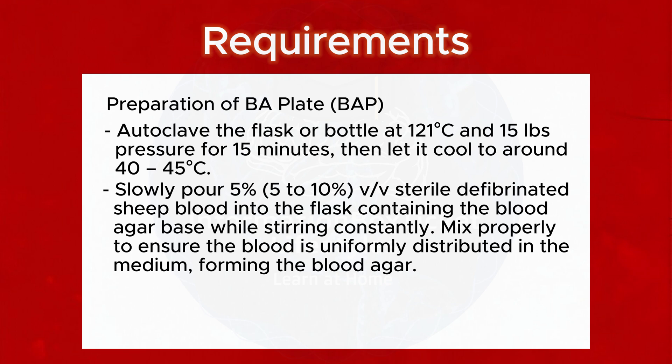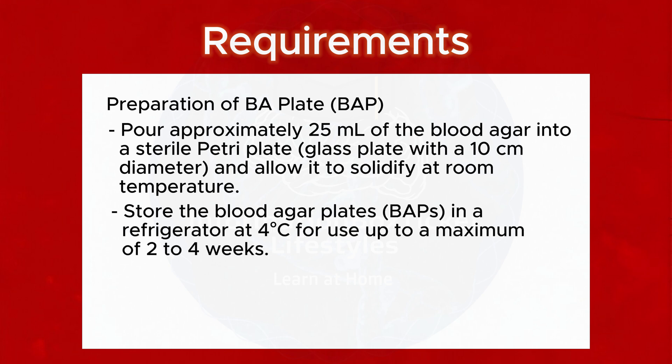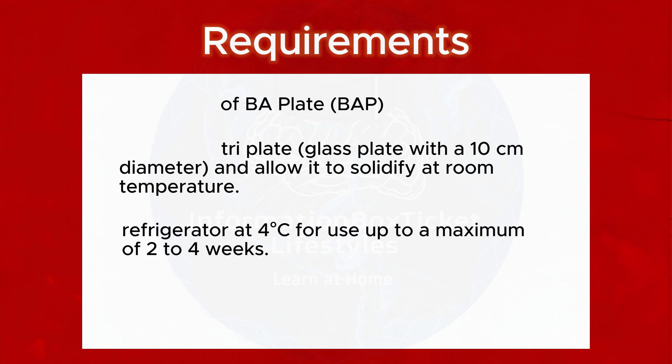Mix properly to ensure the blood is uniformly distributed in the medium, forming the blood agar. Pour approximately 25 milliliters of the blood agar into a sterile petri plate — a glass plate with a 10 cm diameter — and allow it to solidify at room temperature. Store the blood agar plates (BAPs) in a refrigerator at 4°C for use up to a maximum of 2 to 4 weeks.